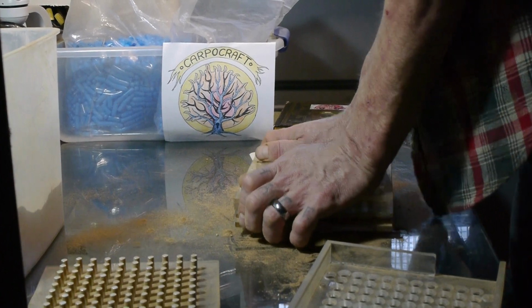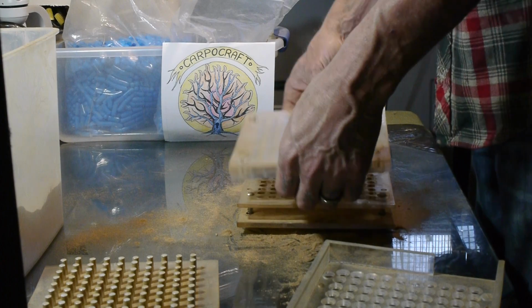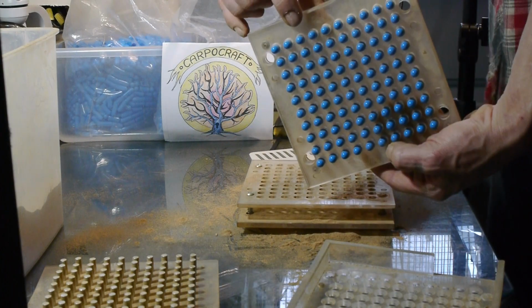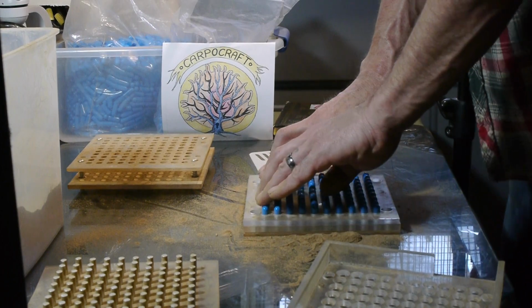Kind of rotate it until you feel like you have it all. Then, pop the whole thing off like this. Just the top two pieces. Leave the bottom. Then, go in manually and lock.